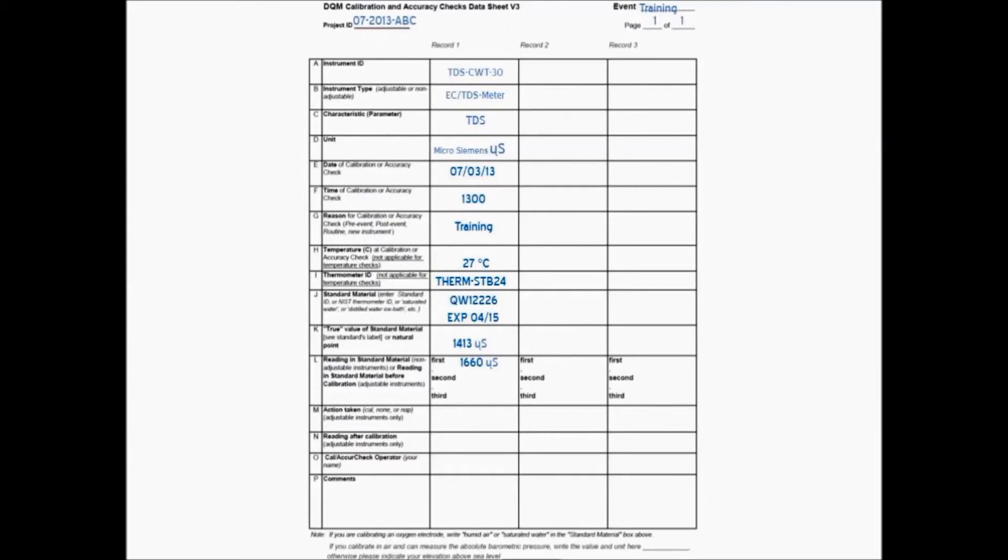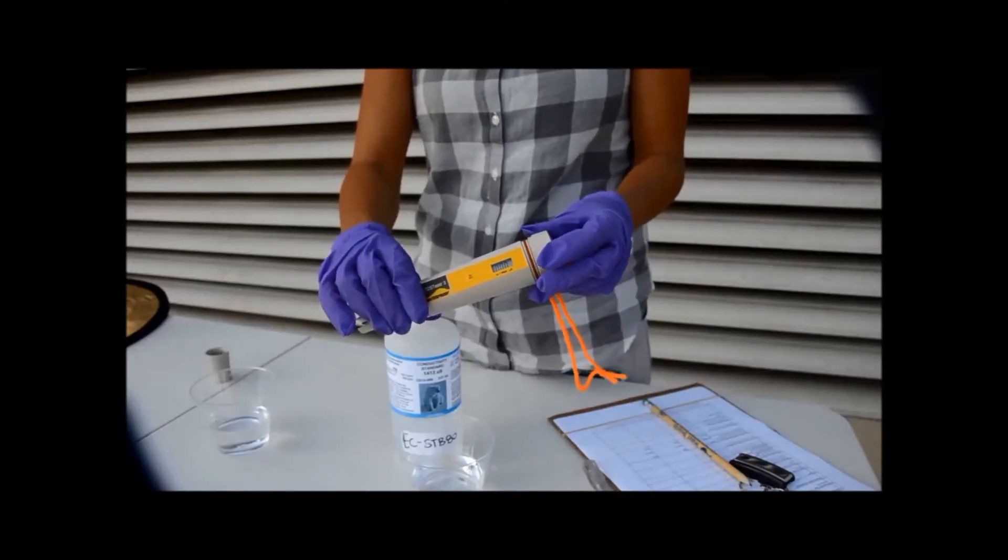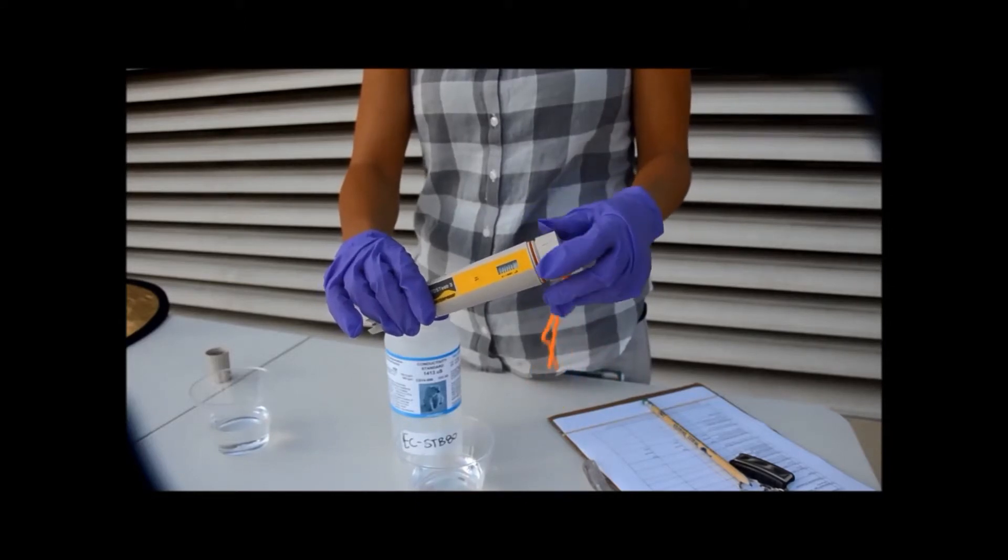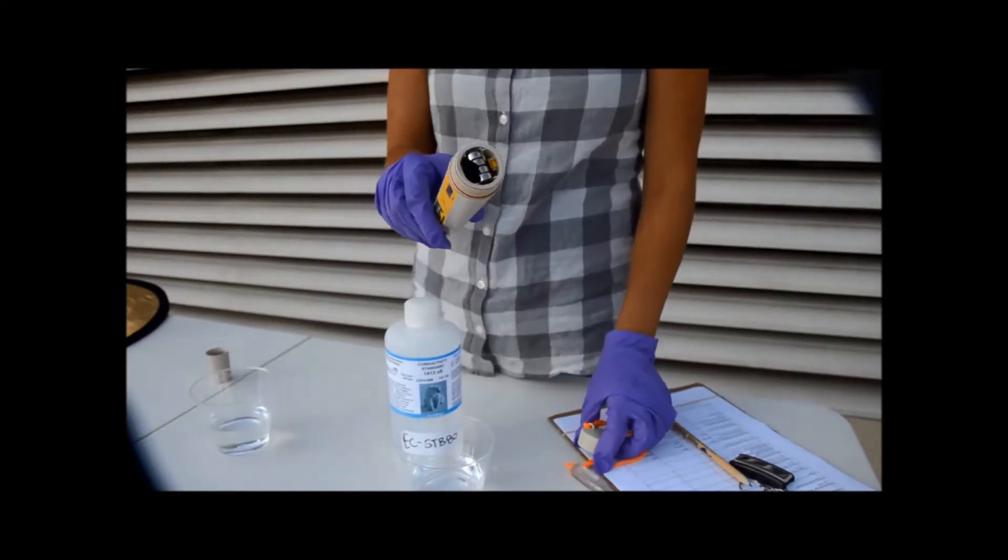Some of the older TDS meters have an adjustment screw. Others use buttons. Adjust your meter so that the output has the same value as your calibration solution.